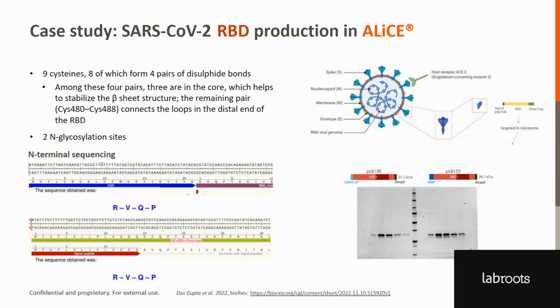So moving from the VLP structure that was a scaffold for potential vaccines towards production of antigens. Like everyone else in the world, we are very interested in working with the SARS-CoV-2 virus and producing proteins of this virus, which can help inform vaccination strategies, and can help inform diagnostics also. And you will remember during the boom of the pandemic that every group, every company in the world had some kind of project working on these proteins.